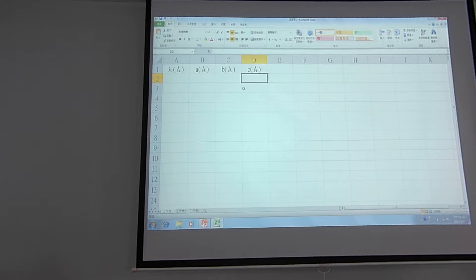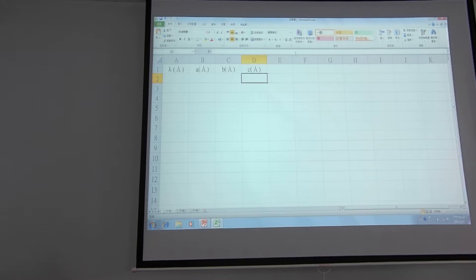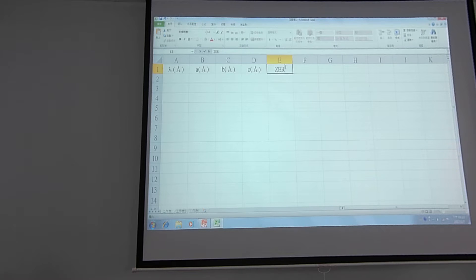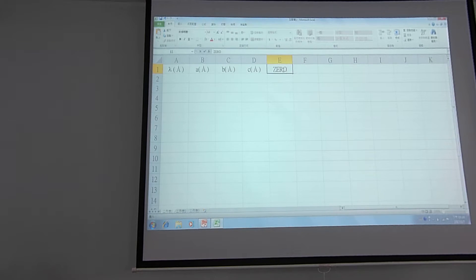I will copy the parameters with Angstrom units into each cell. Then I will add one more parameter called ZERO, which is the misalignment of the sample stage or mis-location of the sample.